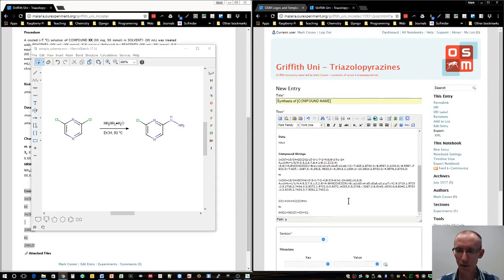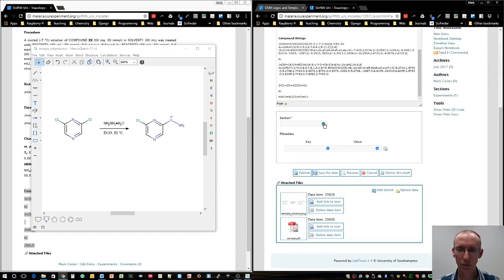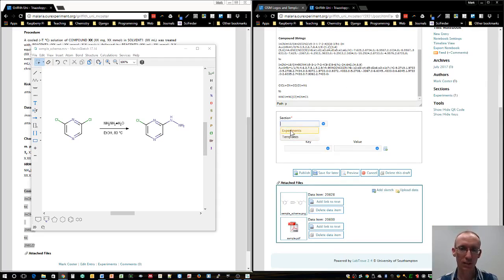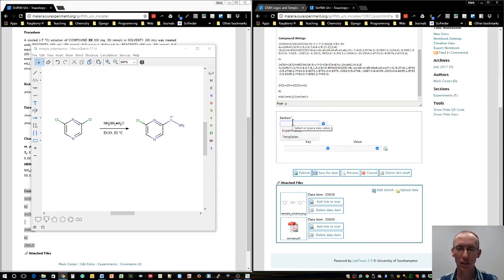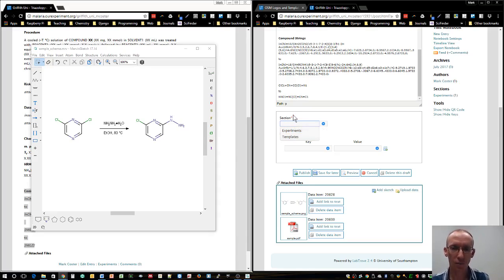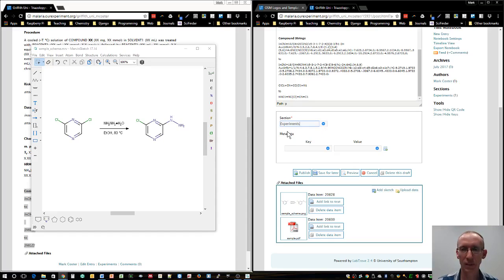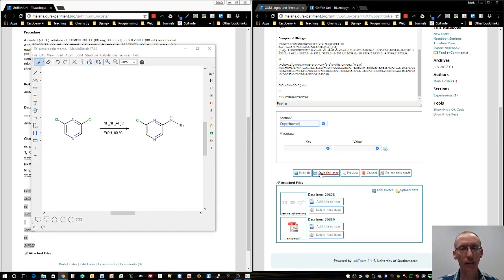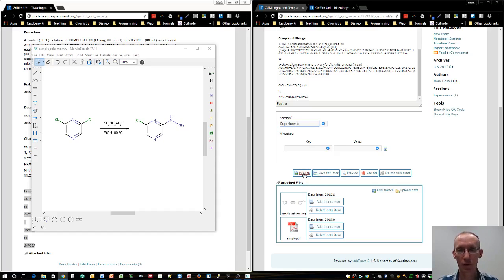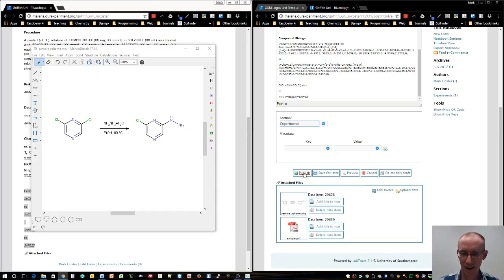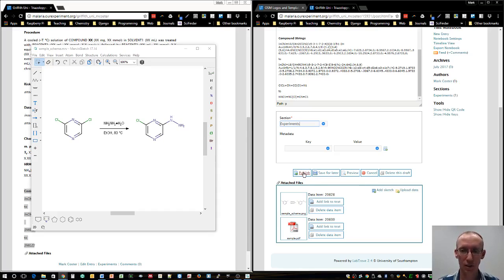To get this finalized, firstly we want to select a section. Really, I think generally you want to select experiments. You can actually type in new sections, so you can have a separate section just for recharacterization of a compound or something like that. But we'll just use the experiments section. We'll ignore this metadata for now.